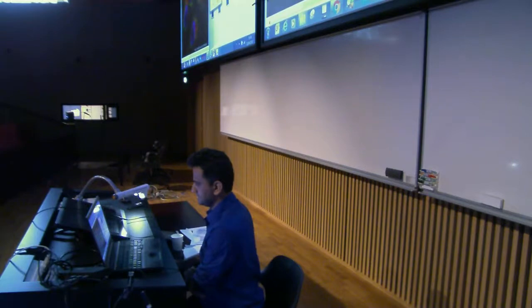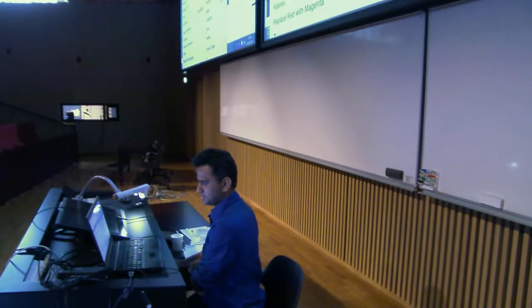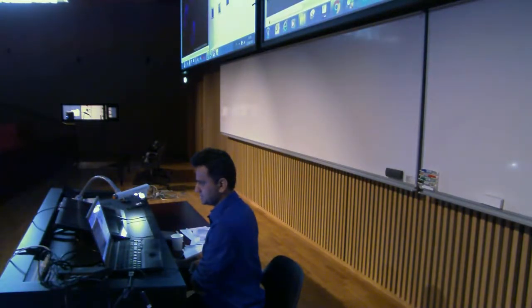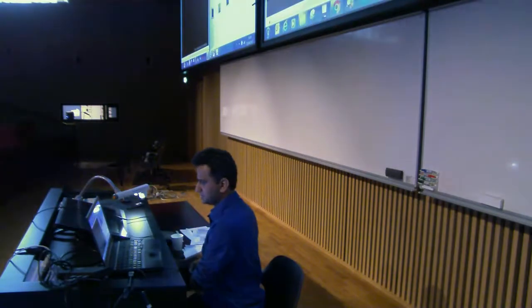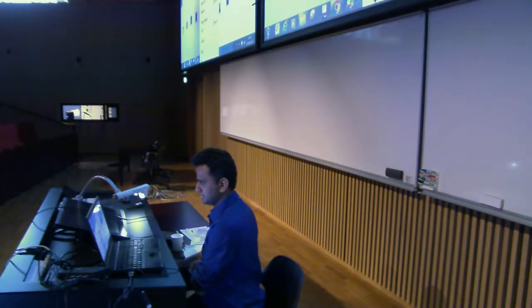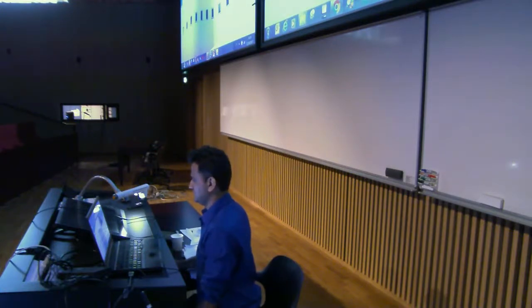What else can I show? Then you go to image, color, make a composite. Channel tool, as I said, you can switch on, switch off, right? What else can you do? Stacks. You can make a montage. Let's go for the orthogonal view now. Let's open something, open samples and go for mitosis, just to understand the terminology of ImageJ.